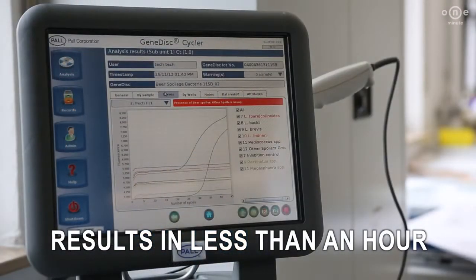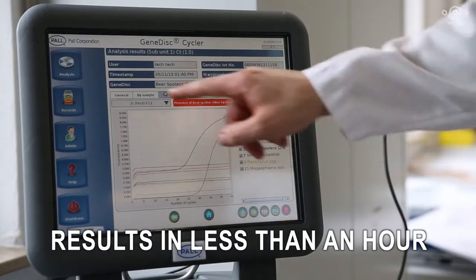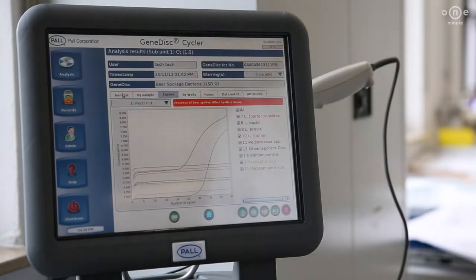In less than an hour, the GeneDisc Cycler will provide interpretation of the results in the general tab. In addition, further details for each sample can be accessed.